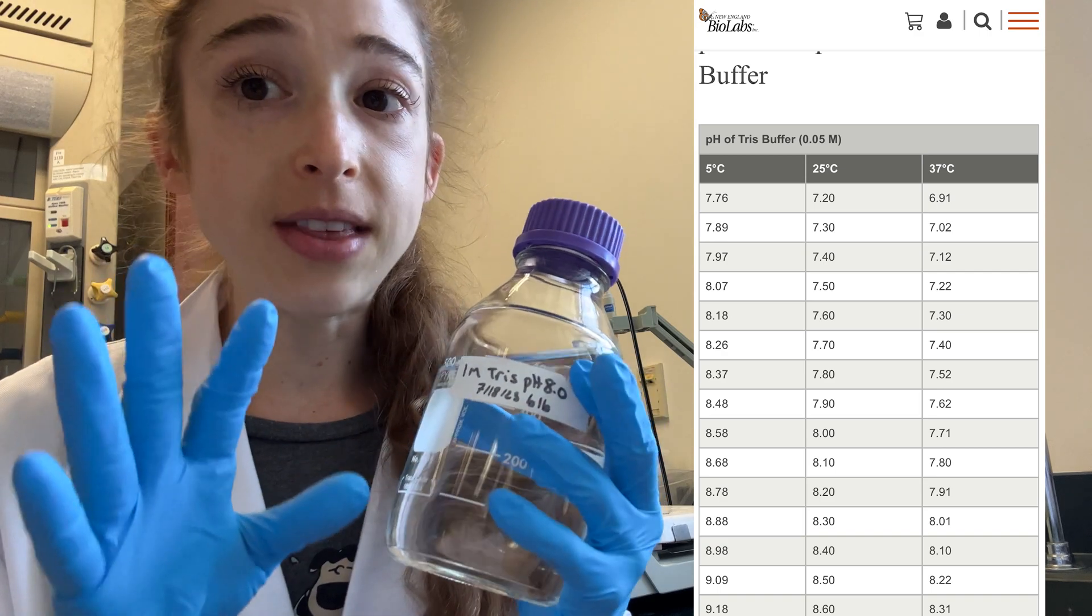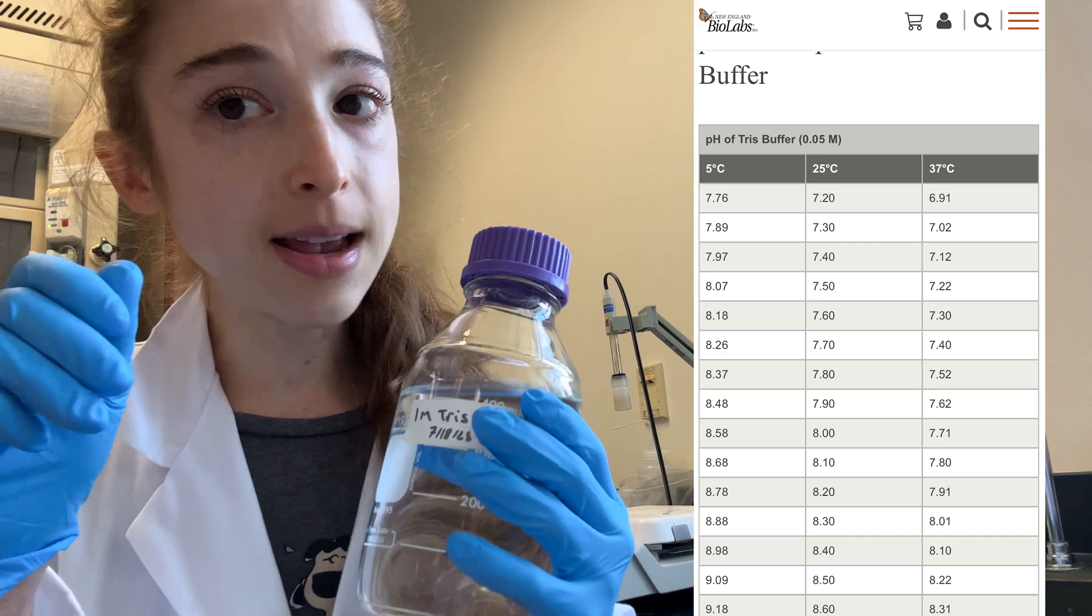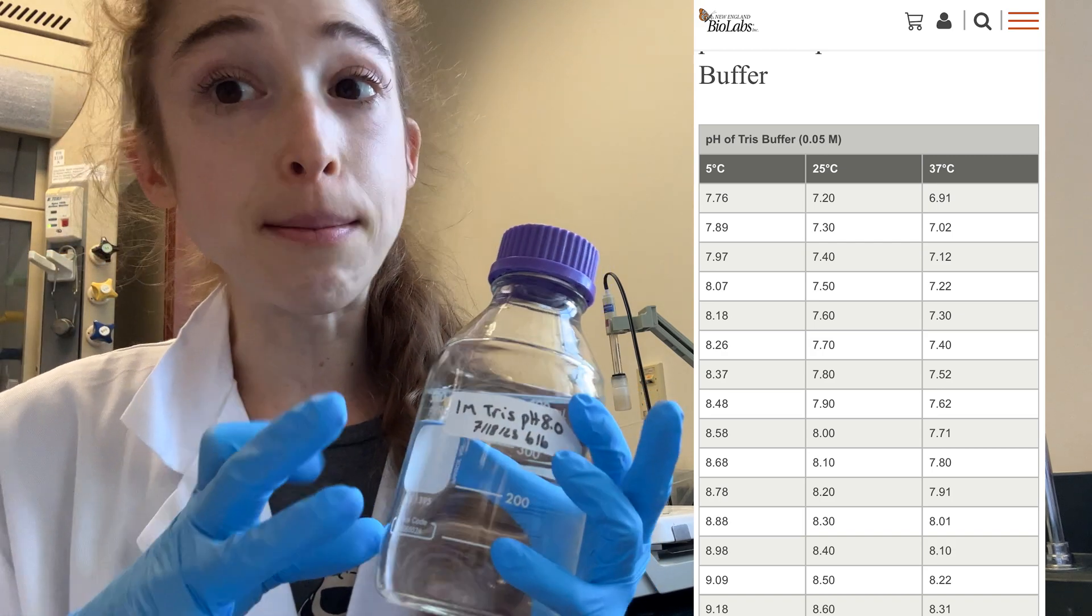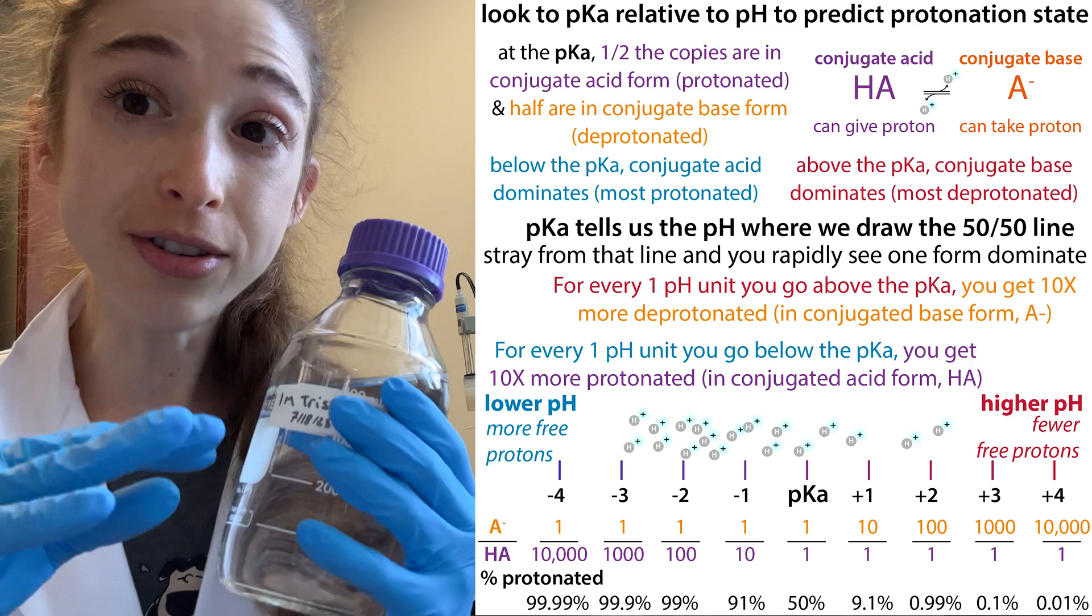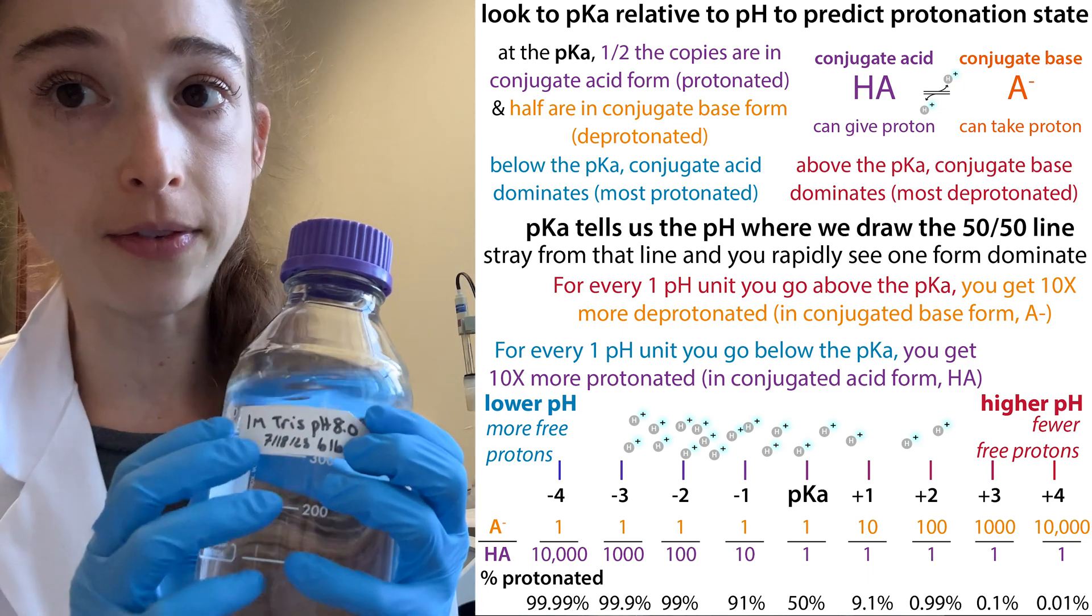You can kind of think of it this way. It's easier to remember that as you increase the temperature, you're going to make it more acidic. You're going to decrease the pKa, make it easier for those protons to pop off of the Tris.